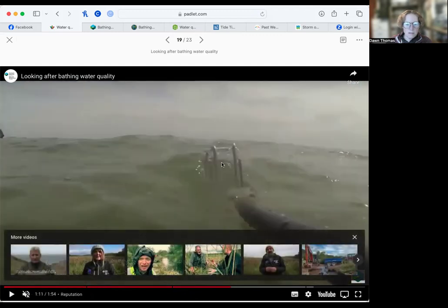So 30 centimeters deep. Take the lid off the bottle, turn it upside down, put that underwater. It will not fill with water as you're putting it down. Get it so that your arm is underwater. That's about 30 centimeters, well, it is for me, until your arm is submerged and the bottle is now inverted under the water. Then turn it upright. It will start to fill. You'll see bubbles come out. Keep following the bubbles until the bubbles stop. Then lift it out of the water.